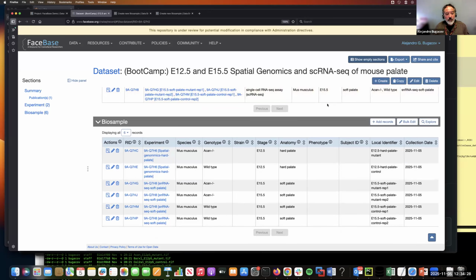The way I will do that, since I said that it's 10 files and I don't want to do it manually, I will show you later how to do it manually. But the way I will do it is using our tool. We have a tool that we call the Deriva Upload tool that we distribute, and you can install in your computer. And once you install it, you basically drop all your files into a directory. You start the tool and upload the file.